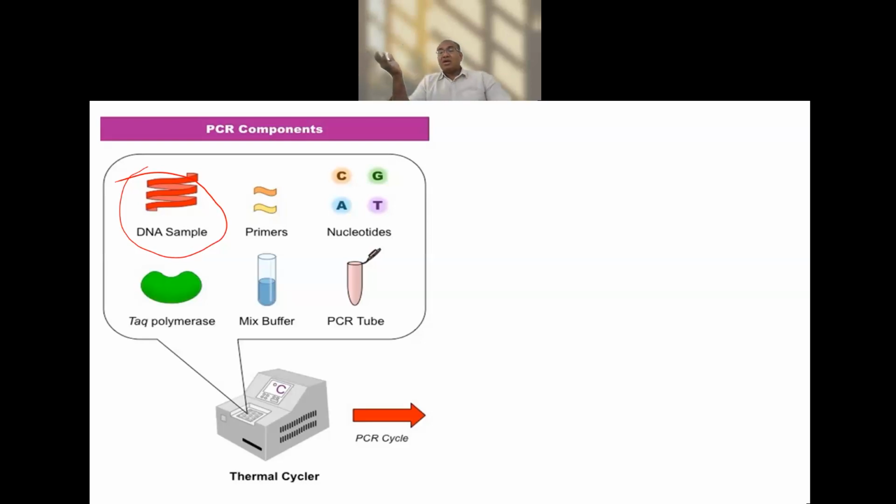How do I know that the tissue which is given in the form of the liver, the biopsy tissue, or in the form of the ovary, has, other than the body DNA, some other infected DNAs? It means the viruses or any antigen which is invading my body.